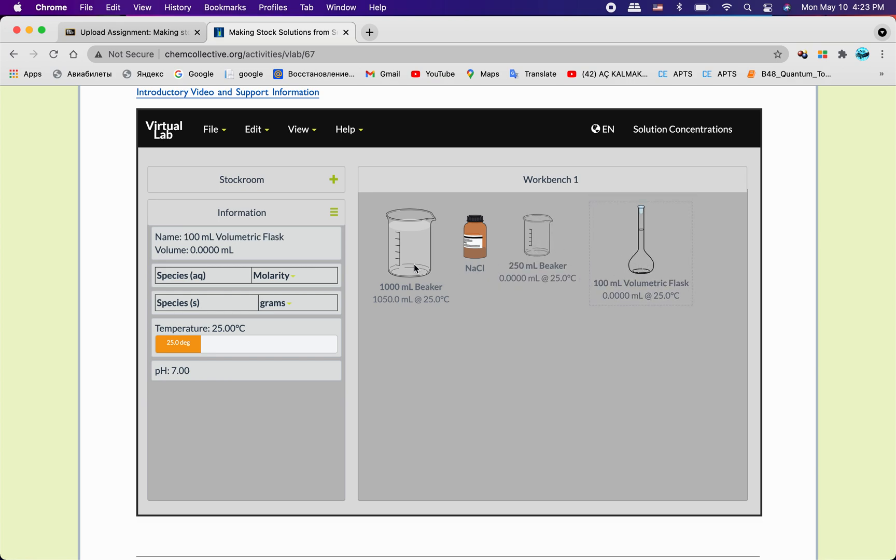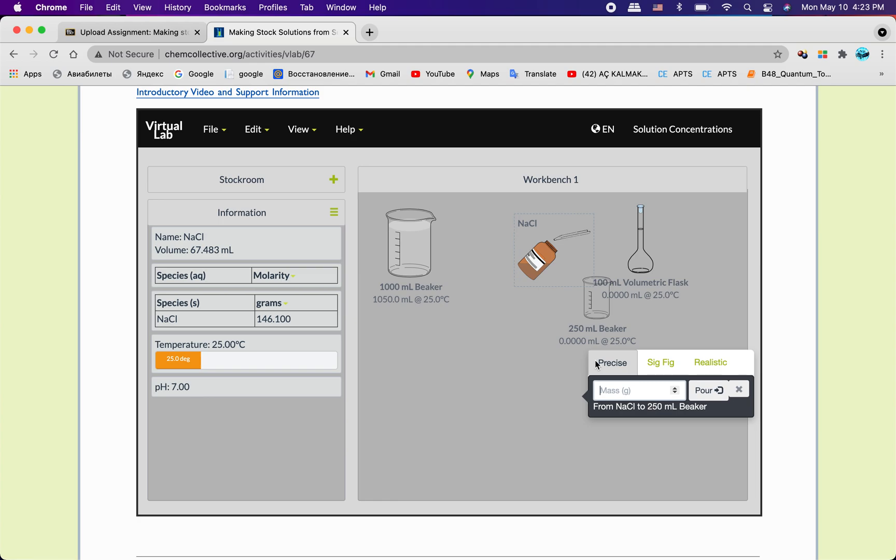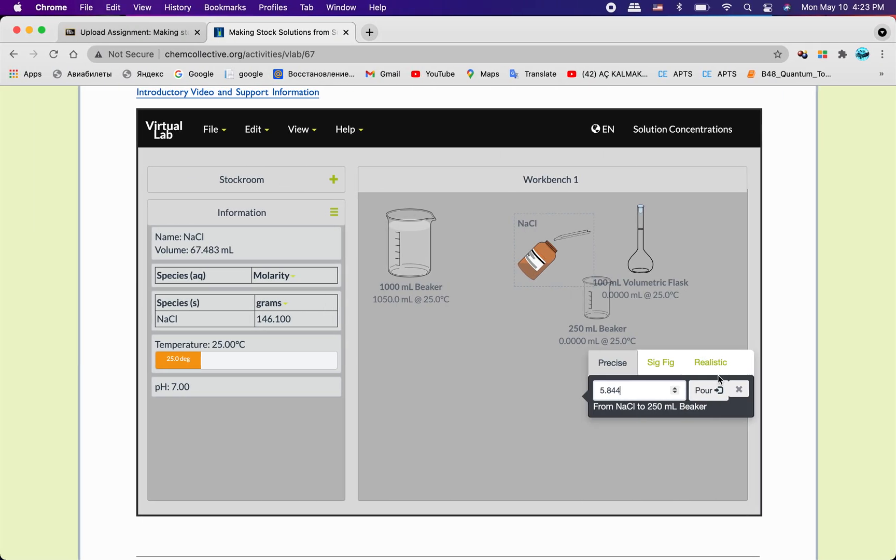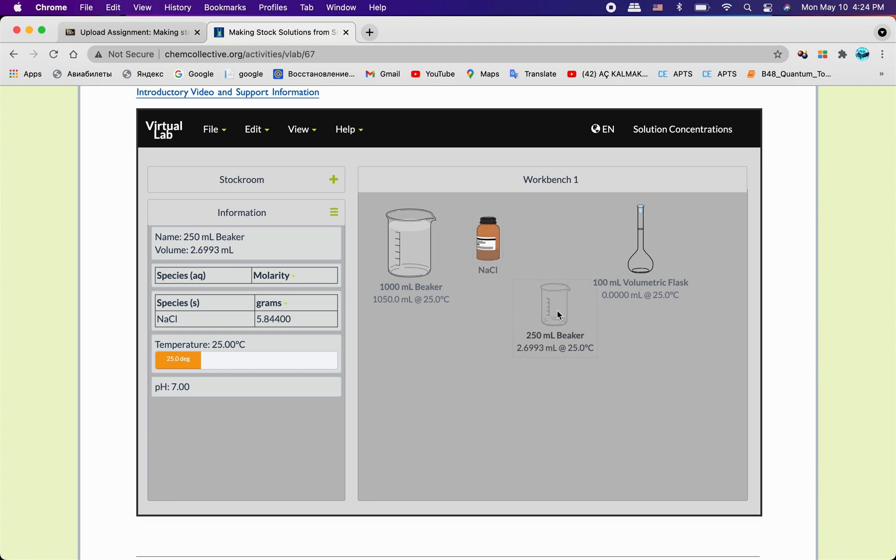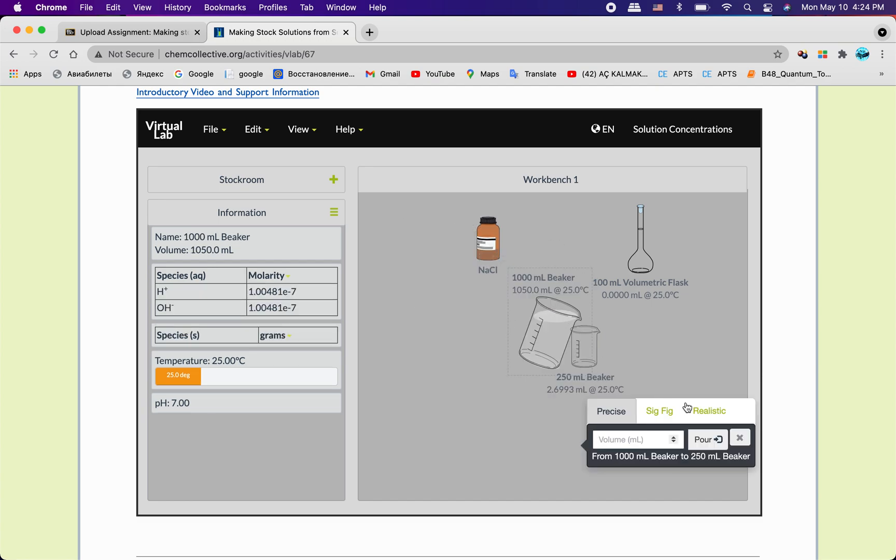Let's get started. I prepared before starting the video some stuff. For example, I took one liter water and I'm gonna put right here, as I said before, 5.844, let me check again, yeah it's true, and pour it. And we see that we have right here two point something, almost seven.